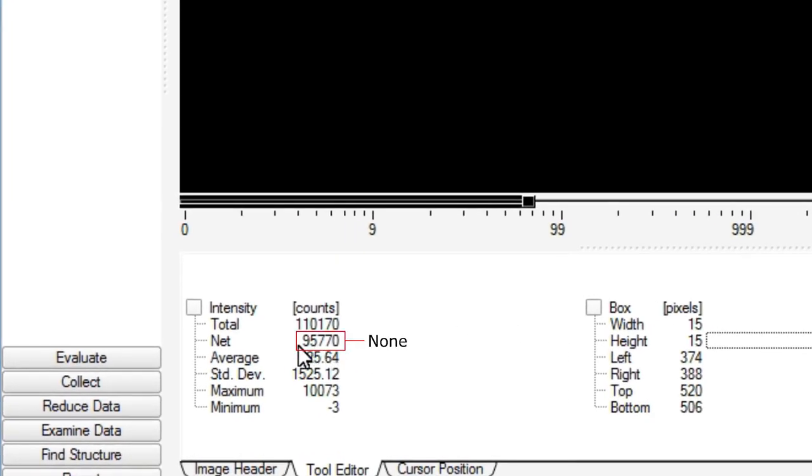For this we choose a square cursor 15 times 15 should be good center it around the bright spot and read out the intensity. The exact same thing we do now for all three frames we collected write down the intensities and compare them.